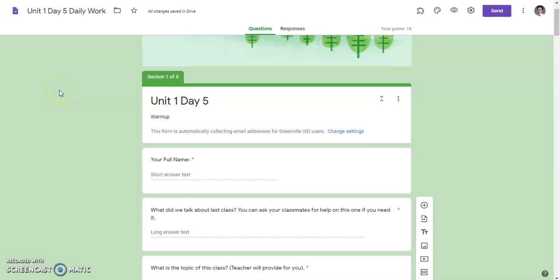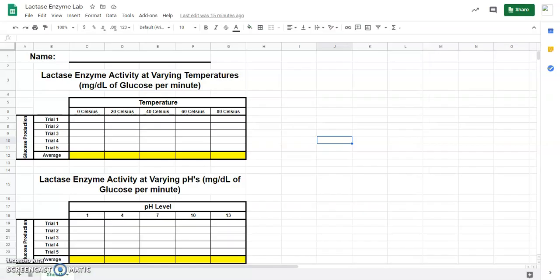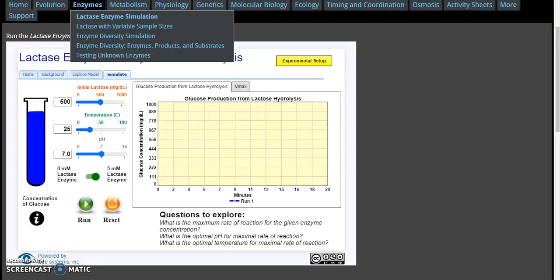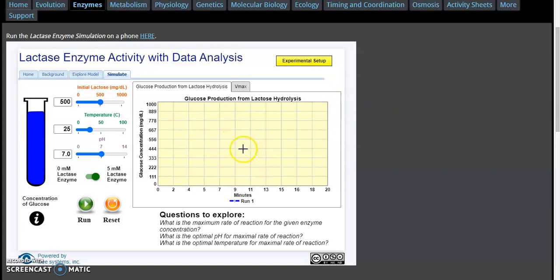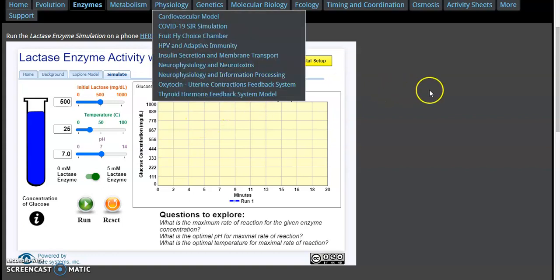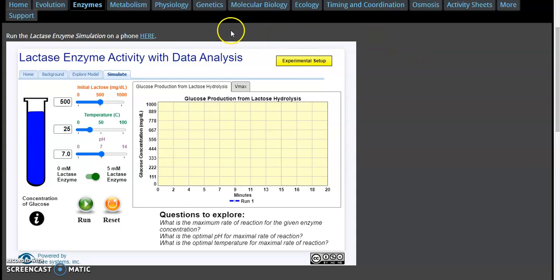Okay guys, so today we are doing an enzyme lab. The enzyme lab is going to look like this. Now instead of you guys doing it yourself, I recorded me doing this lab so that you could just follow along with me and record my results and then answer the questions in the assignment. So instead of you doing this, you're just going to watch me do this.